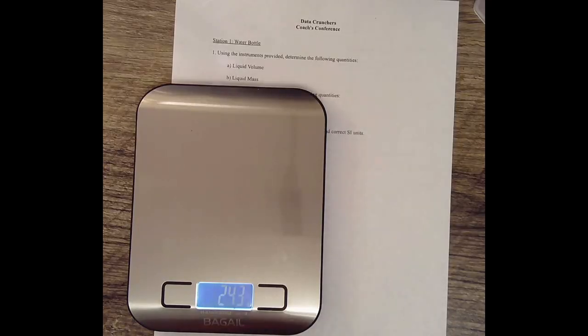Alright, so we're going to be addressing number 1. It says, using the instruments provided, determine the following quantities. Liquid volume, liquid mass. When you think of liquid volume, I want you to think of how much is in a container. When you think of liquid mass, I want you to think about how much that container weighs. Mass is weight, volume is how much space it takes up.